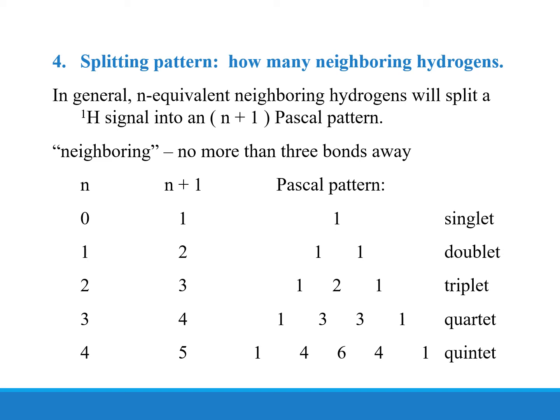Okay, so one proton split by neighbors with 3 hydrogens will have a quartet, with an intensity of 1:3:3:1 ratio, right?